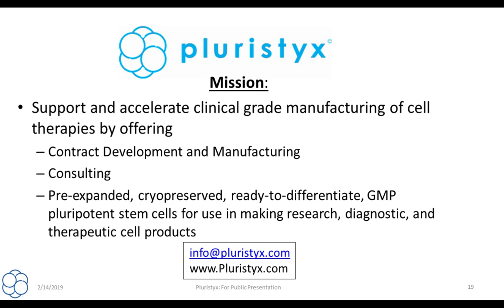So for a clean room that's not GMP, I think if you're making your working cell banks or so-called GLP material that follows the supply chain and the batch records and the process that you use for making the end product, you can manufacture material for your pre-IND studies that's not in a GMP environment. However, the master cell bank does have to be GMP. So at some point, you're going to have to make a break and make that GMP master cell bank, knowing that you can take some of those vials back to a research lab, which is clean but not GMP, and make essentially development or research working cell banks, and under GLP or sufficient quality to meet regulators' requirements, you can make your end material, but you can't skip the GMP master cell bank.